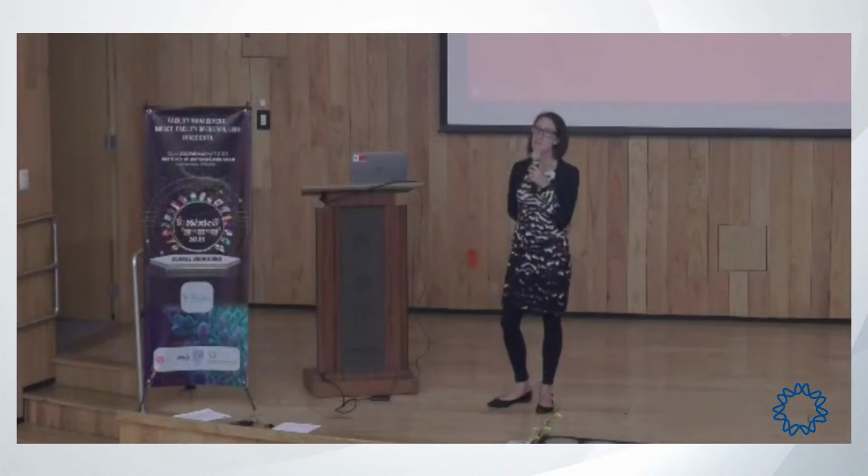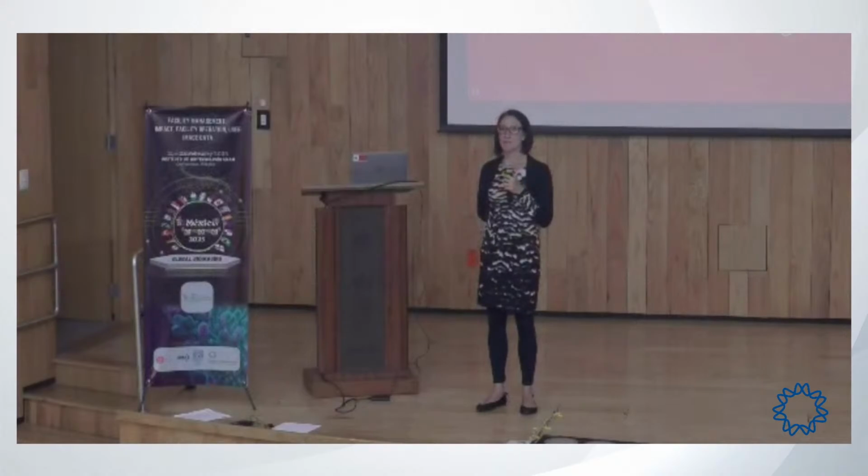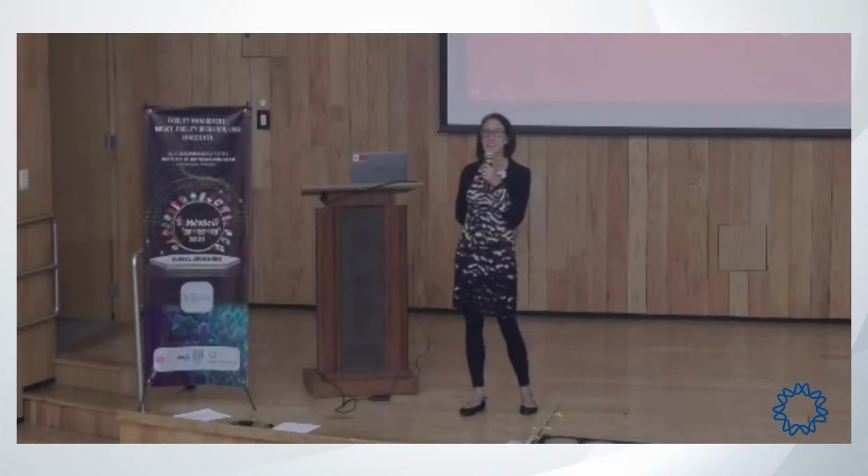I was wondering about proteins that are not very stable, like very disordered proteins. So you showed us proteins that have a stable structure, but what happens with proteins that have disordered regions, and can you have the same resolution?